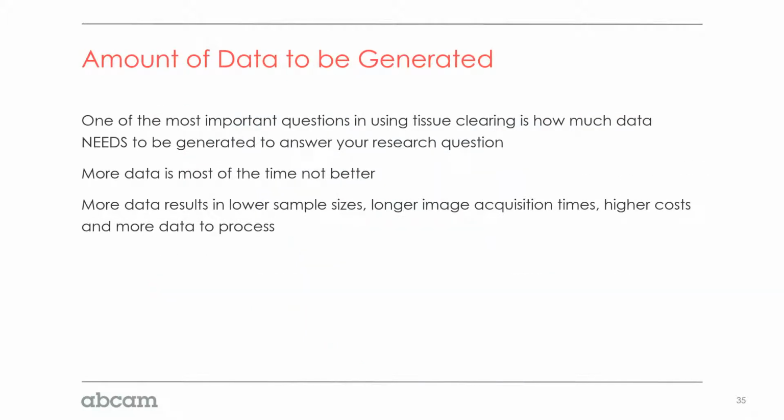One of the challenges we see from many researchers is the data. We get through labeling, tissue clearing, and imaging, and then we generate a substantial amount of data. A lot of researchers struggle with what to actually do with it, how to process it, how to view it. Many researchers are simply interested in getting some pretty pictures for publication, and that's relatively straightforward. But actually analyzing this data can create a lot of bottlenecks, which is why when we work with our clients on 3D tissue imaging projects, we stress up front that while we can acquire substantial amounts of data from a tissue, we need to ask ourselves what data is actually meaningful to answer my research question.